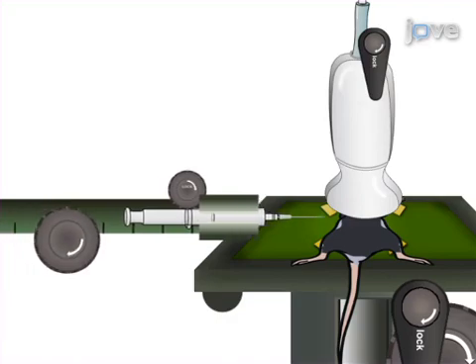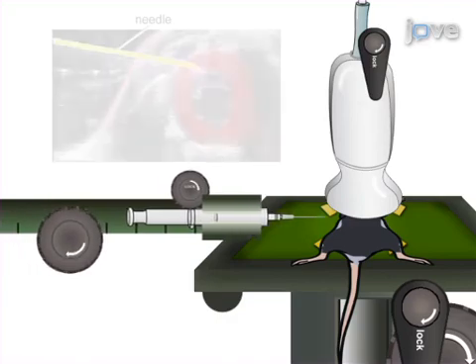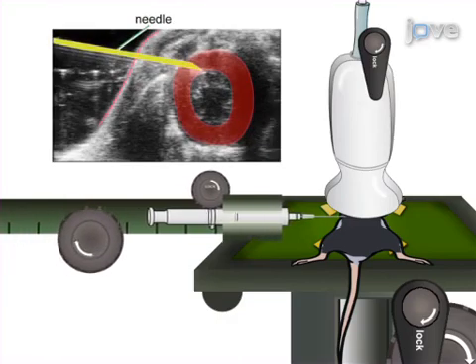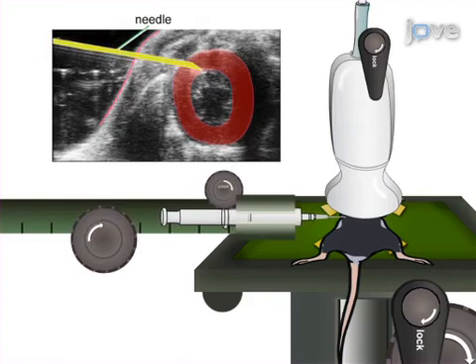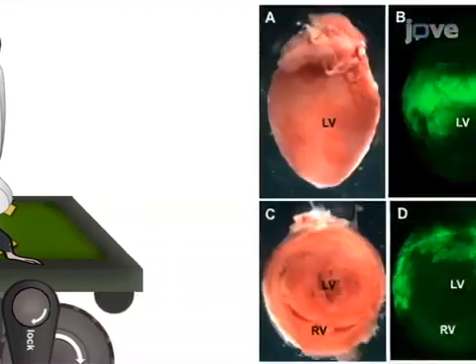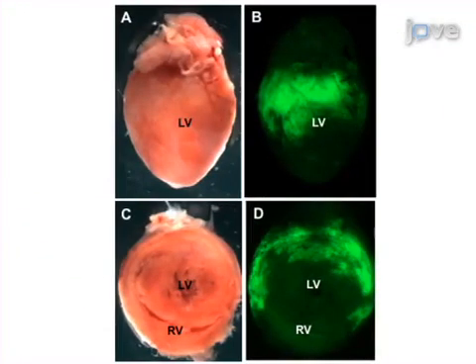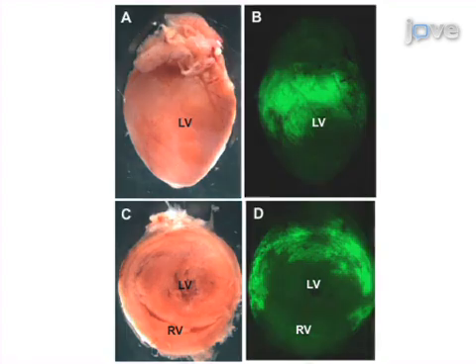Finally, under ultrasound guidance, the needle tip is carefully advanced into the chest wall and myocardium, and injectate is safely and effectively delivered. Cross-sectional microscopy of the murine myocardium is used to show the successful delivery of a tissue marker to the desired myocardial target.